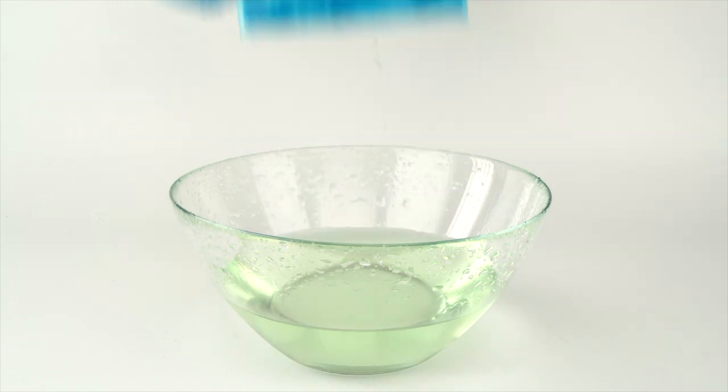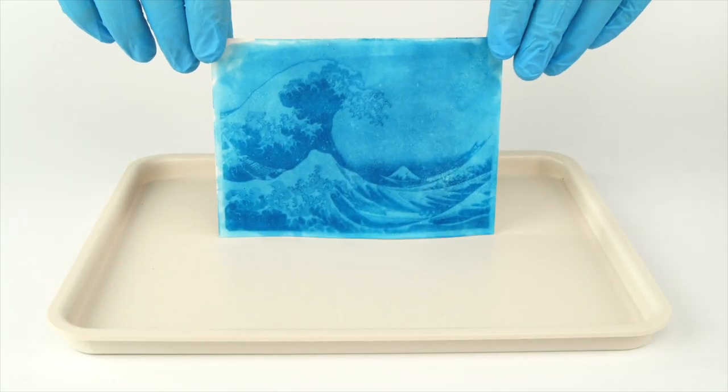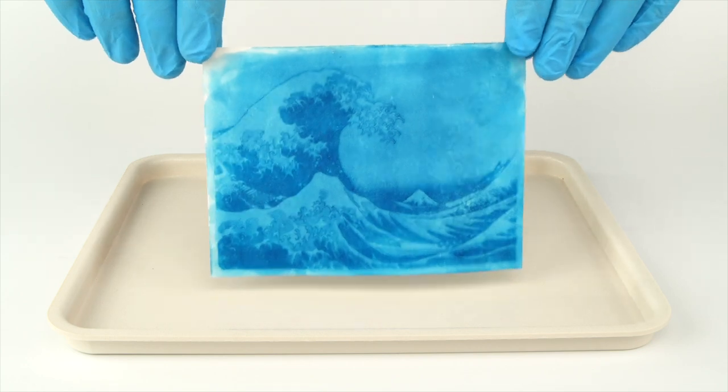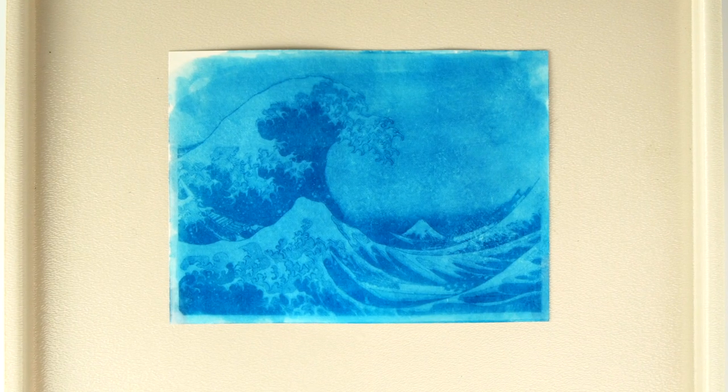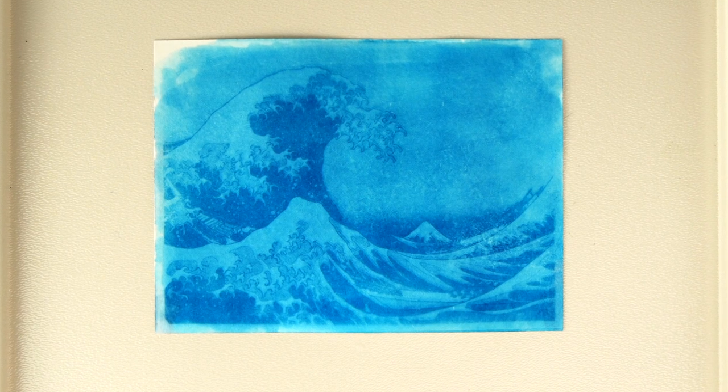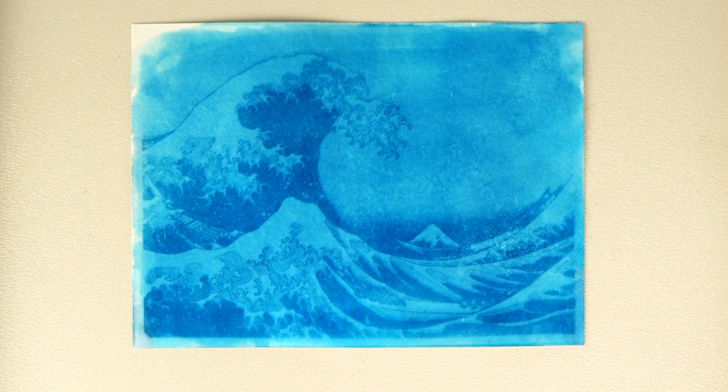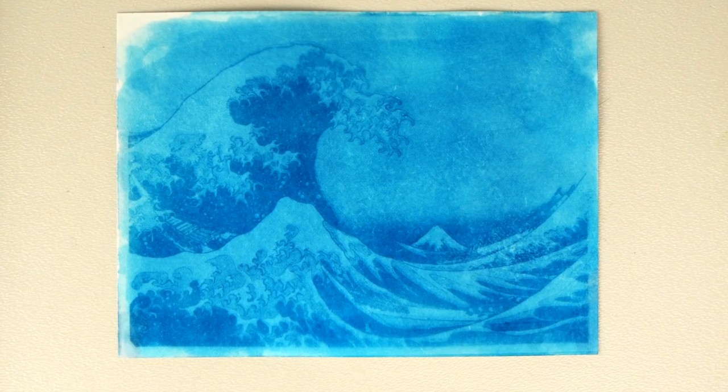Light initiates a reaction in which the iron 3 ions and ammonium iron 3 citrate receive an electron and turn into iron 2 ions. When these ions react with potassium hexocyanopherate 3, they form a stable blue compound known as berlin blue. This causes the cyanotype image to appear.